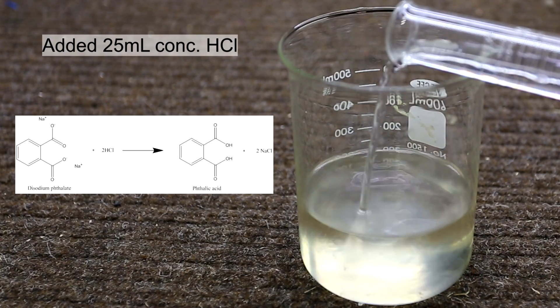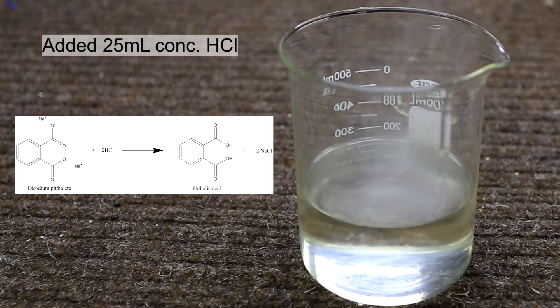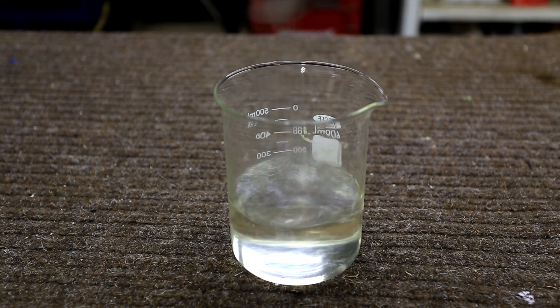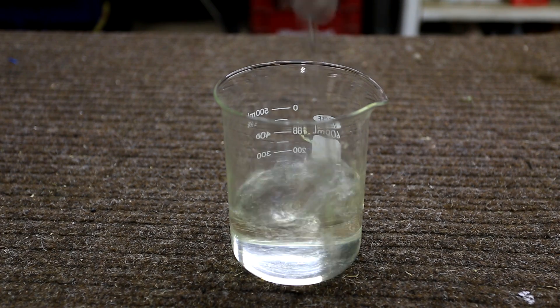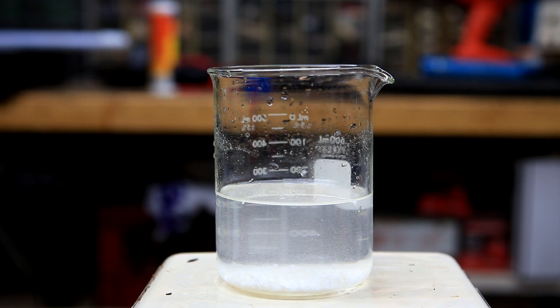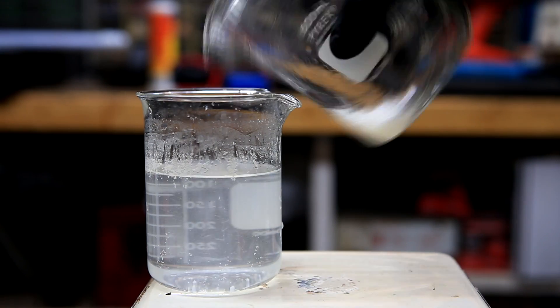Once the lower layer had cleared up as much as possible it was drained into a beaker. To this was added 25 milliliters of concentrated hydrochloric acid to regenerate the phthalic acid from its salt. The solution was stirred thoroughly and then placed into a freezer to allow crystals to form. Once the solution reached about 0 degrees Celsius it was removed from the freezer. At the bottom, some crude phthalic acid crystals had formed and the water was decanted off.